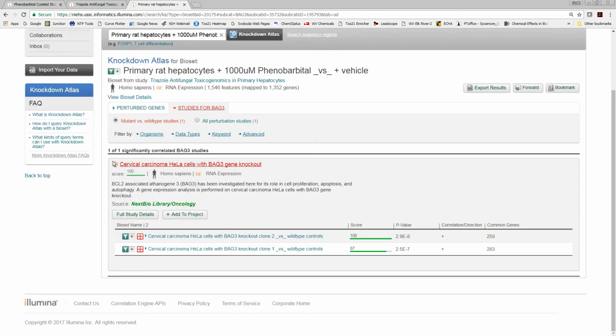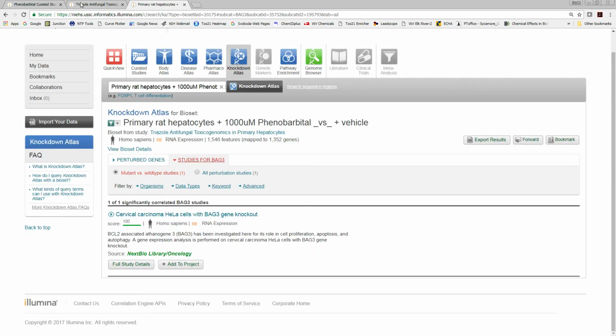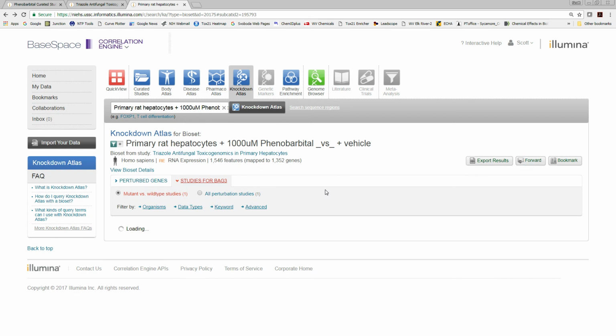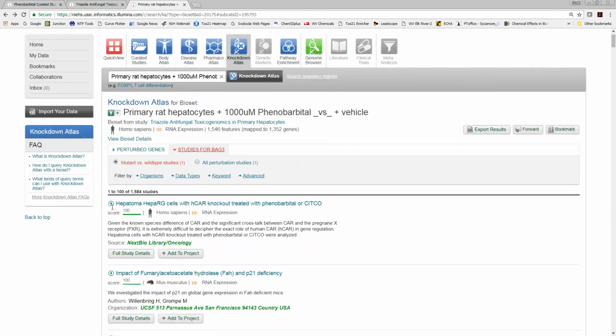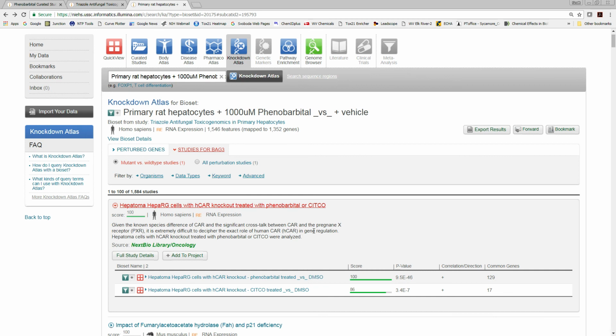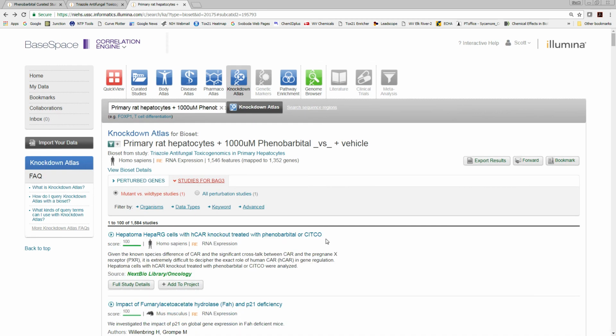This is actually quite useful for looking at things like transcription factors that may be driving your association. So when you knock it out, the gene expression actually is inverse to what you're anticipating. So this happens to be very powerful, and it's actually worked out quite nicely for me in looking at other treatments. This one is not showing as much as I would anticipate.